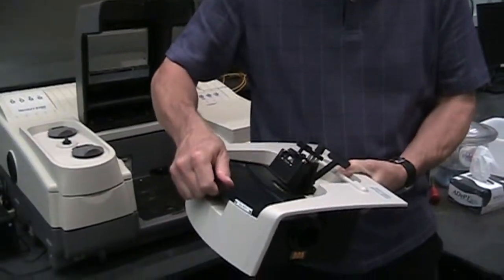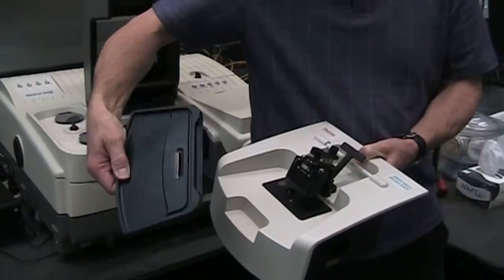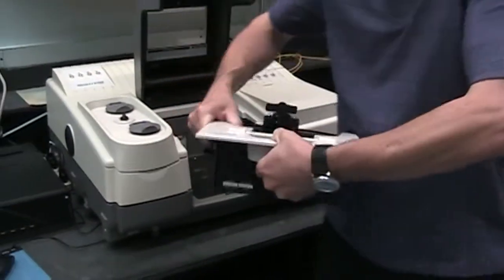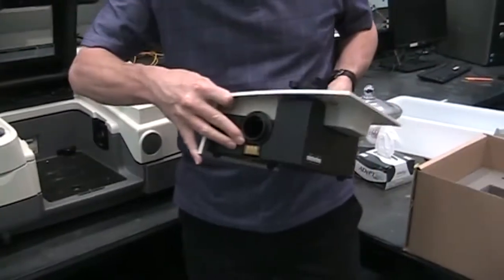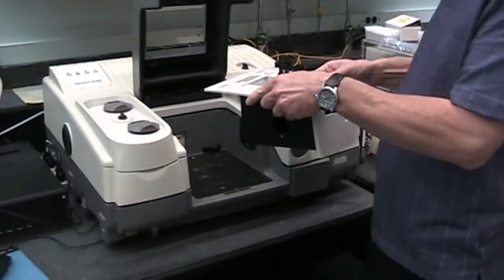If you've used ATR before, you know it involves a crystal. In our case, the crystal is more of a trough, so we'll put the sample in this recess that has a germanium crystal. It fits in like this. Okay, but this simply slides into the spectrometer. As a matter of fact, there's a little key here, or a chip, that can actually read what accessory is inside the instrument.